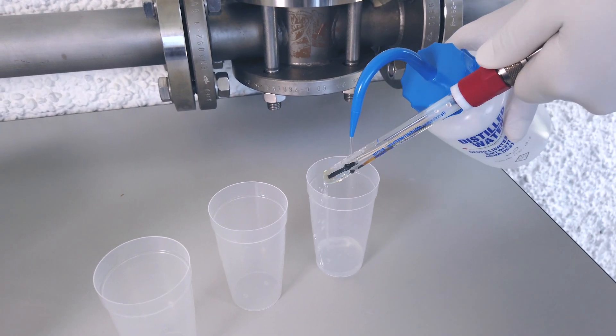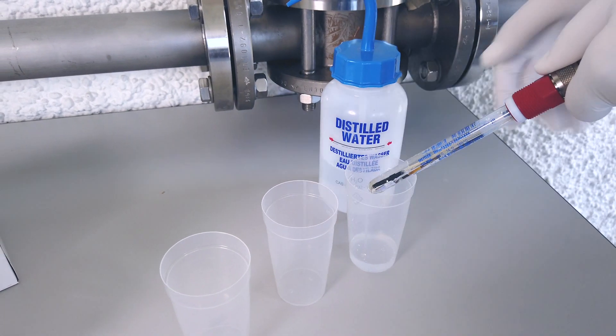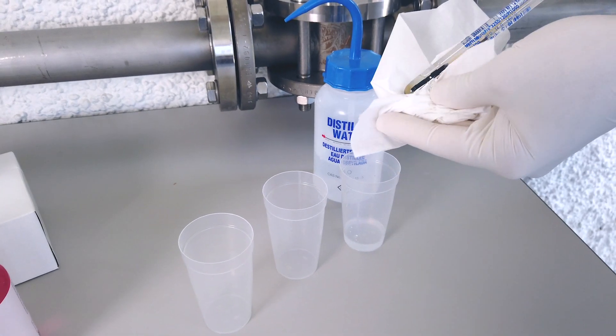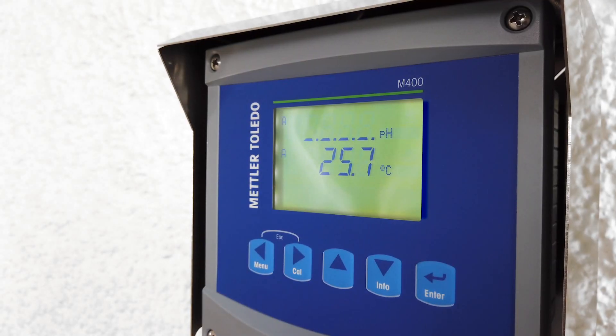Rinse the sensor with distilled water in order to remove any possible contamination, then dry it. Don't rub the sensor — gently pat it dry. Rubbing can induce an electrostatic charge which can affect the measurement.